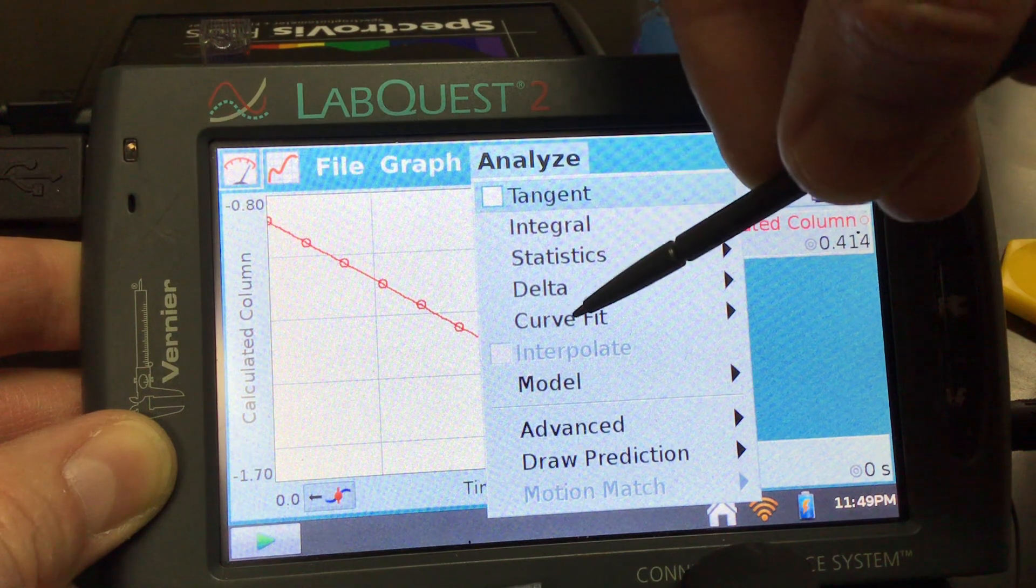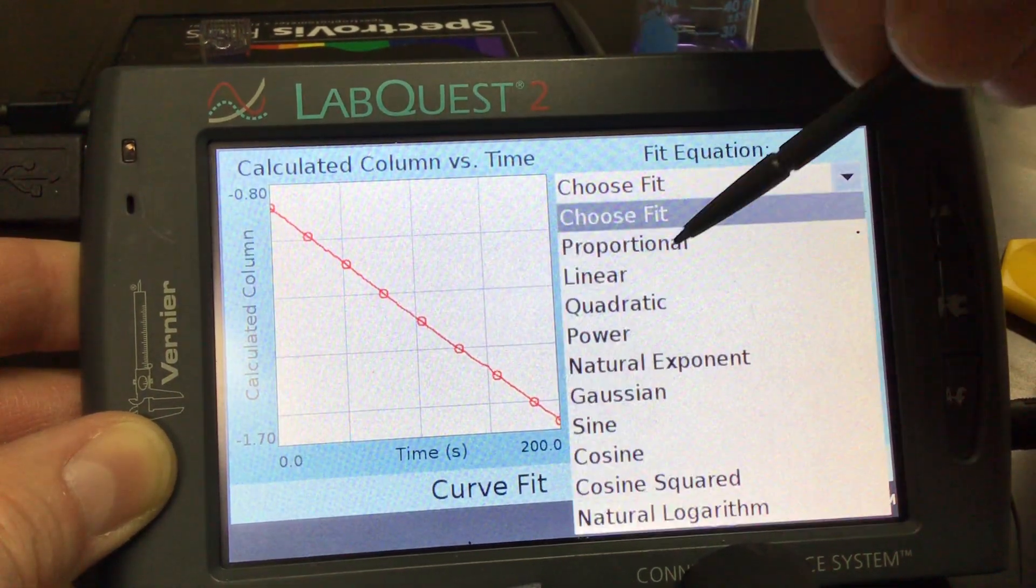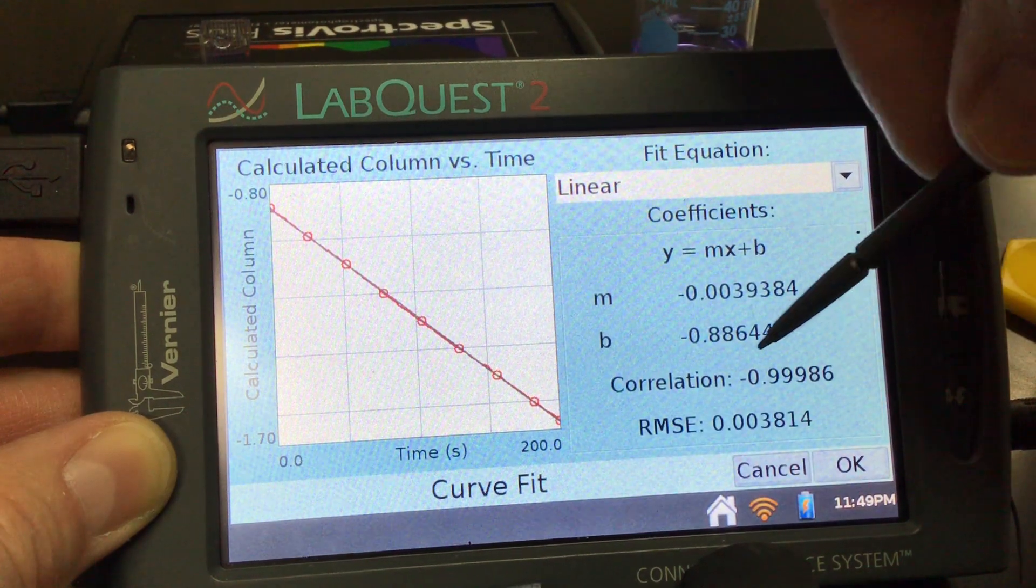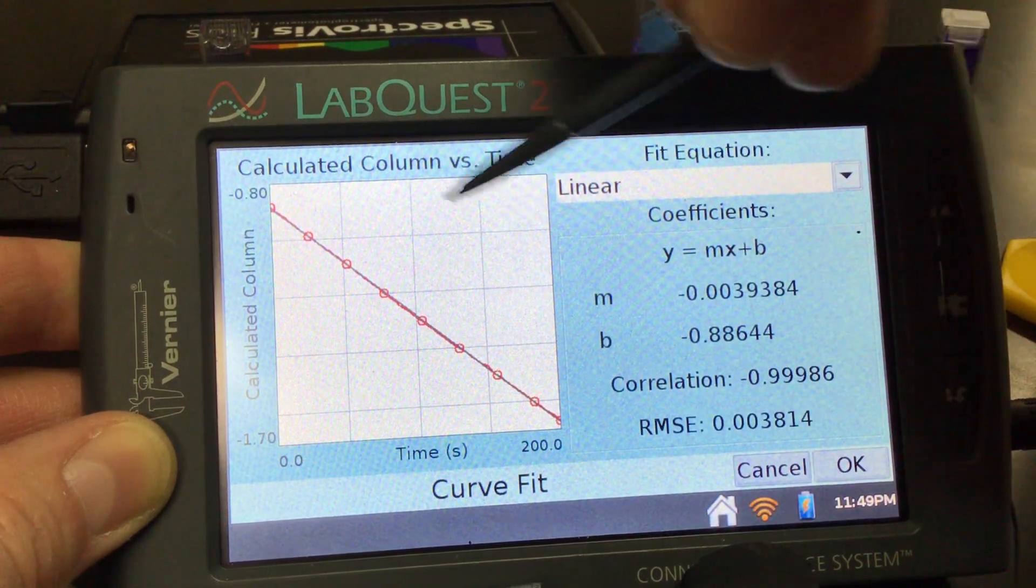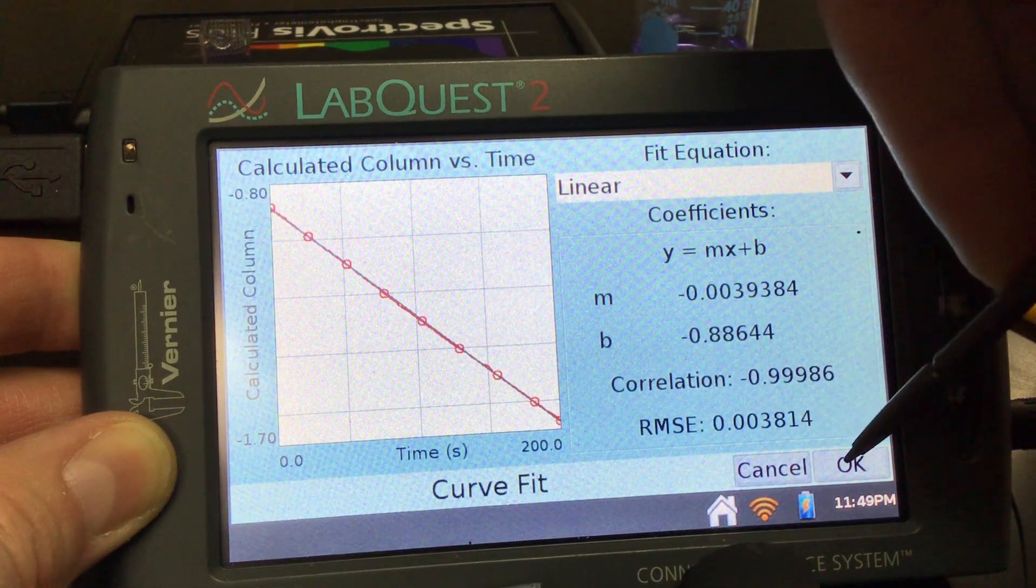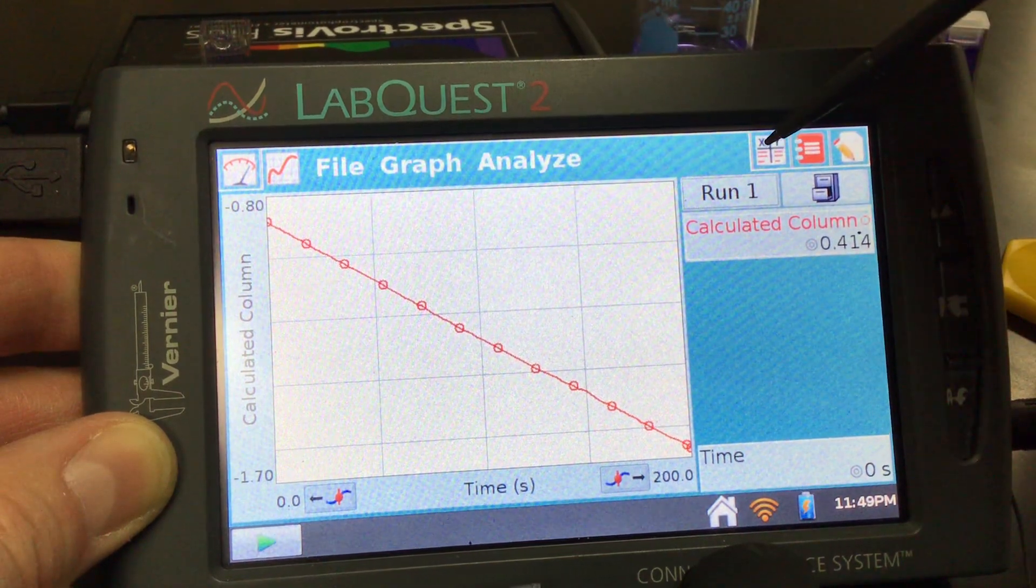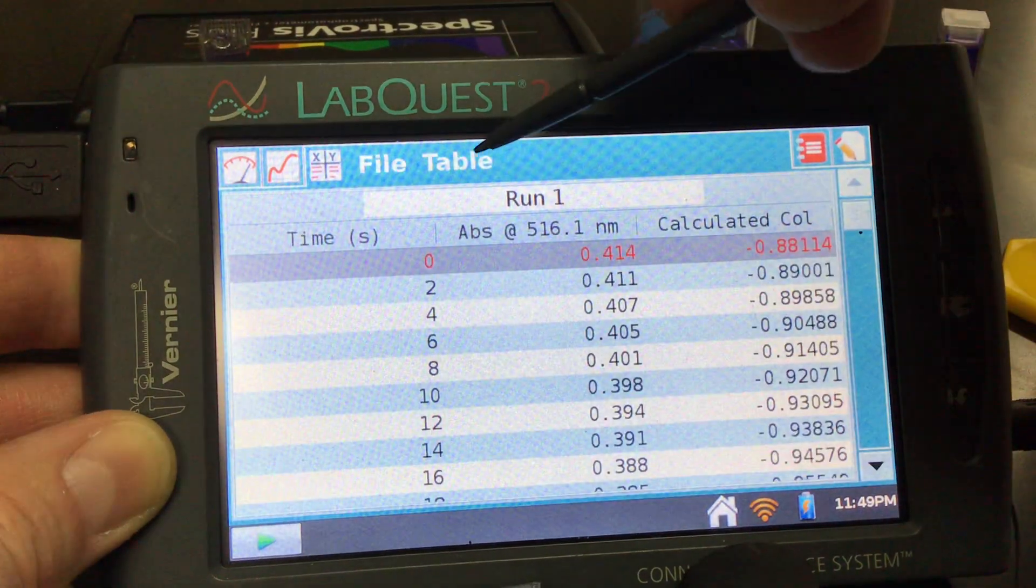If we were to do the curve fit and check it, I think we're going to have a really high correlation value. So linear fit... yeah, that's really, really good. We see the line pretty much matches our data exactly.